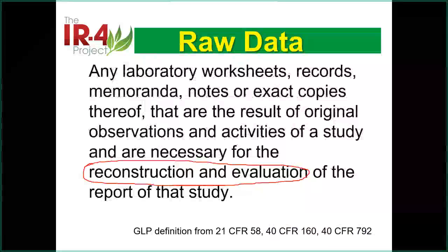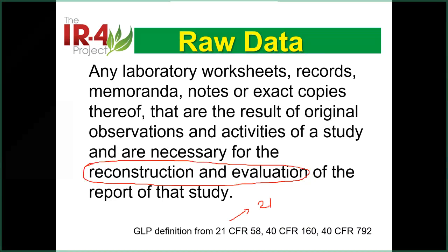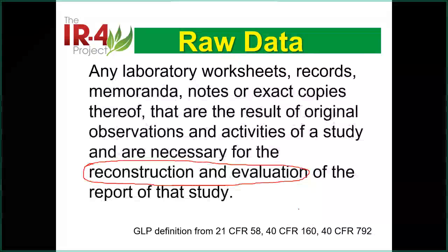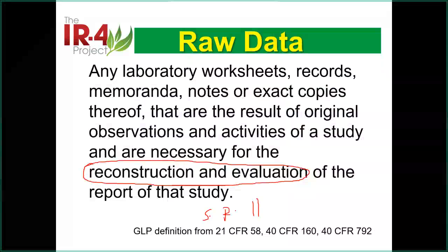So later, I think it's probably around the year 2000 sometime, the FDA had another one. It's 21 CFR Part 11. Well, let's just write this down a little bit. Even though right now we are still using this for electronic data keeping, the idea is the same. We call that section 11, or Part 11.